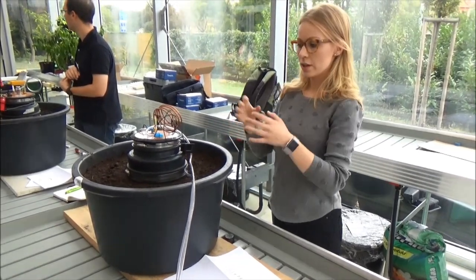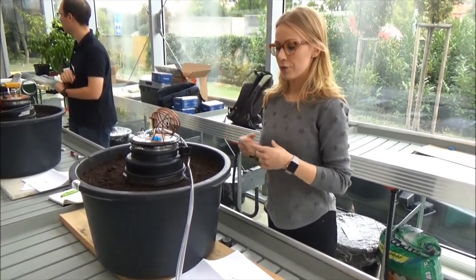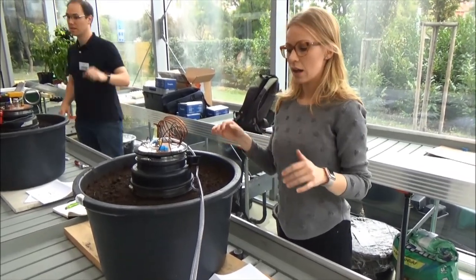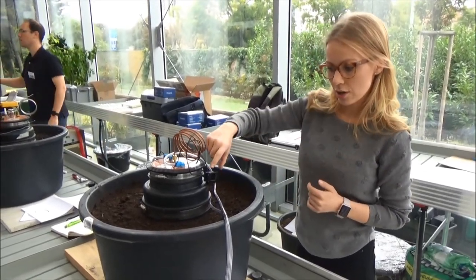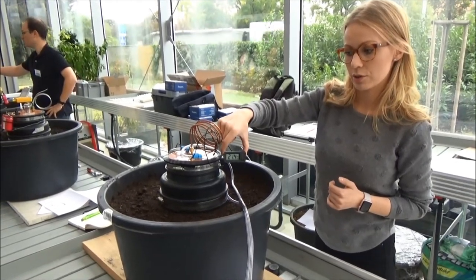Here we have sample B. The chamber is now closed — it's closed for 45 minutes, after which we open the chamber and let the concentration stabilize to the ambient concentrations. We have a temperature sensor here, so we measure the temperature all the time during the measurements.